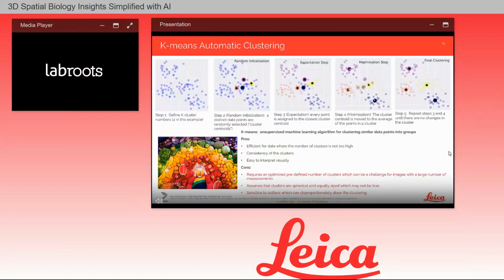On the next couple of slides, I'll go a bit more into details about the automatic methods that I just mentioned that are available within Aivia. The first is a k-means clustering method, which is a well-established, decades-old method that is fairly robust. The only challenge here would be that the user has to know what the right cluster number should be for them to get meaningful data.